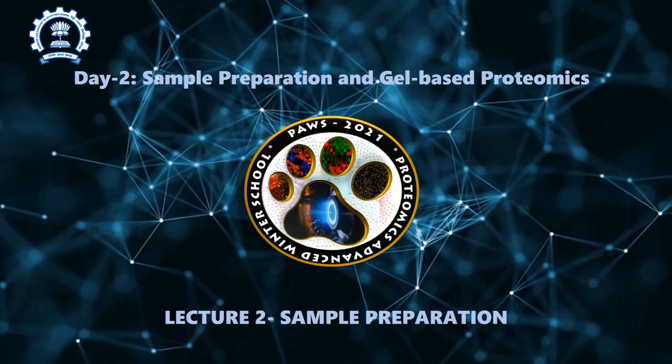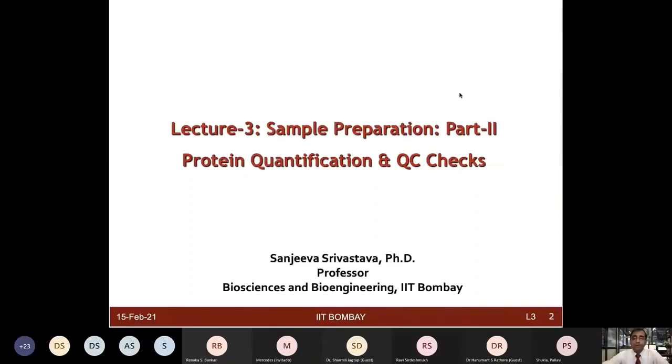Lecture 2, Sample Preparation. I conveyed to you the significance and the emphasis of good sample preparation strategies. As you will appreciate, proteomics is not just a technique where you can simply use a set of protocols to do things like polymerase chain reaction or NGS. It requires really careful consideration of the workflows involved, and that is where you can gather knowledge from the available protocols and different literature reviews.